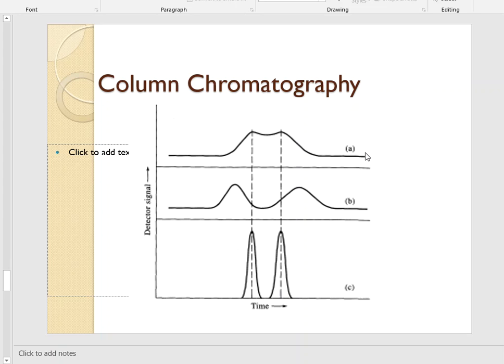And for A, I think everyone would agree that those two peaks are not separated. Where we find the problem is B. And this is an issue that we've struggled with for years and years and years: how to determine if something is fully separated or not, and not really just be subjective about it. So that's why we've introduced this resolution equation.